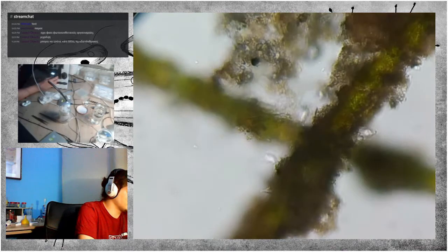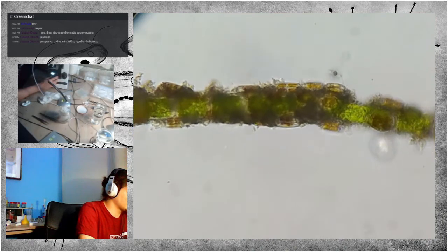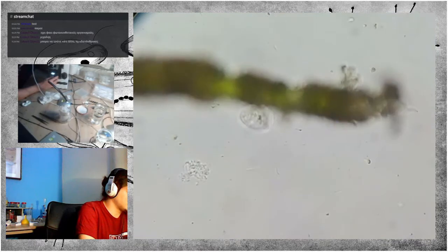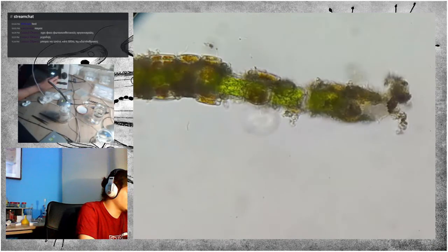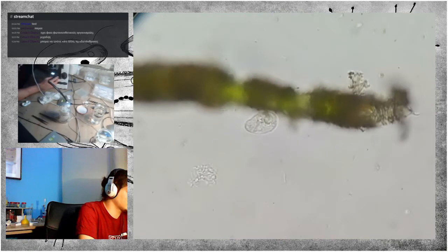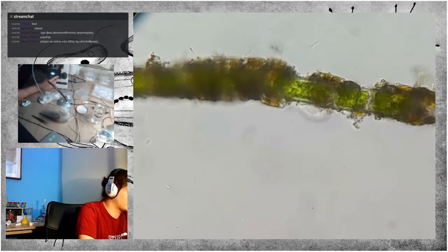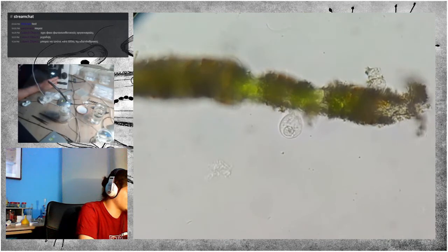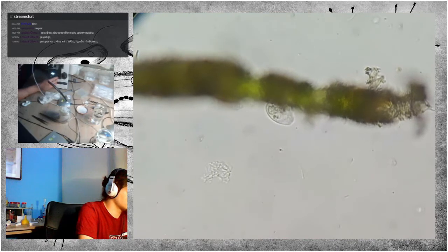And yeah, the stentors are basically trumpet shaped. Imagine, for example, a trumpet, but with a blue hue, moving and flexing around. The stentors are filter feeders, meaning they circulate the water around their oral apparatus, and they filter the things they can eat with membranelles, which are cilia fused together to make sieving structures. Now, here's another ciliate, which I don't know what it's doing.